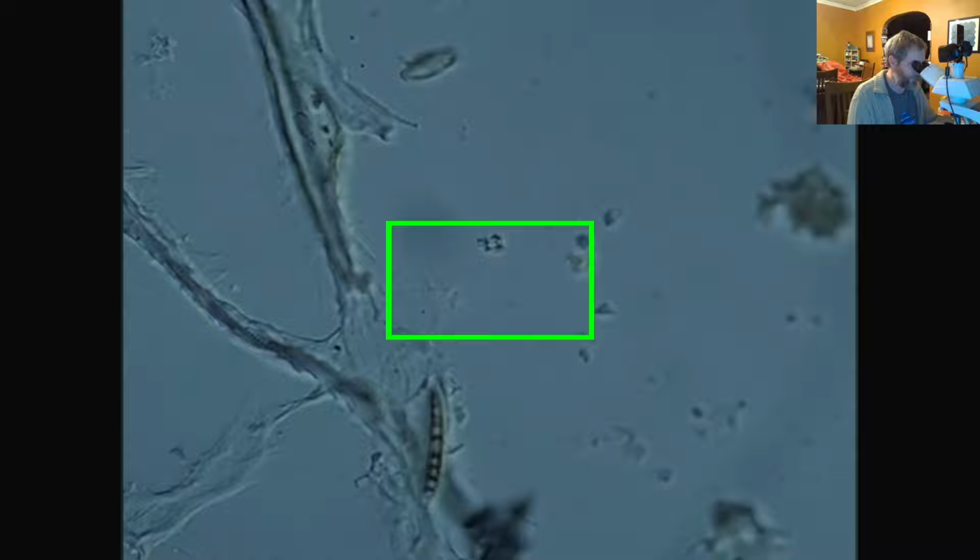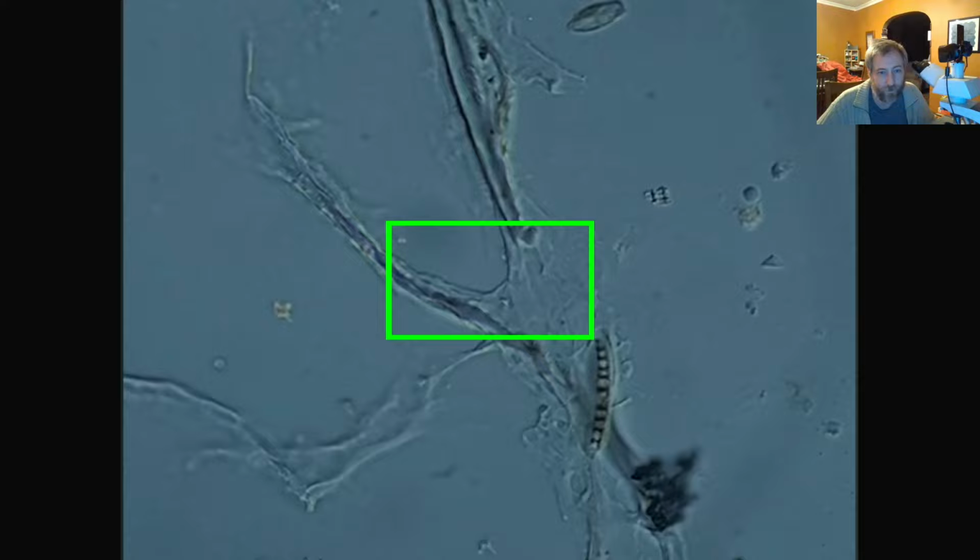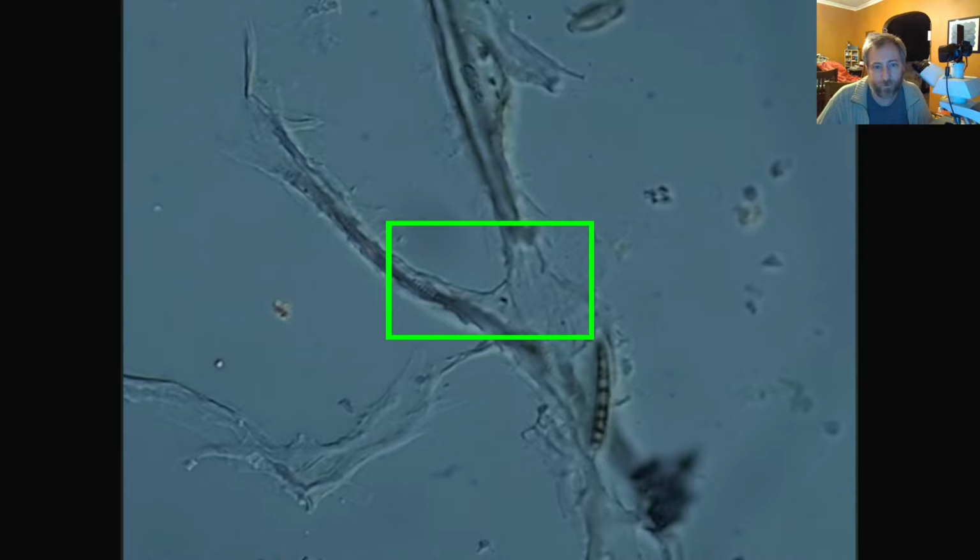So I think somebody was asking me about these dendritic shapes. I think they meant like this. These are probably just pieces of organic matter. Some of the really large Gomphonemas actually create stalks that look something like this. So it could be some organic matter that's excreted as EPS from diatoms.